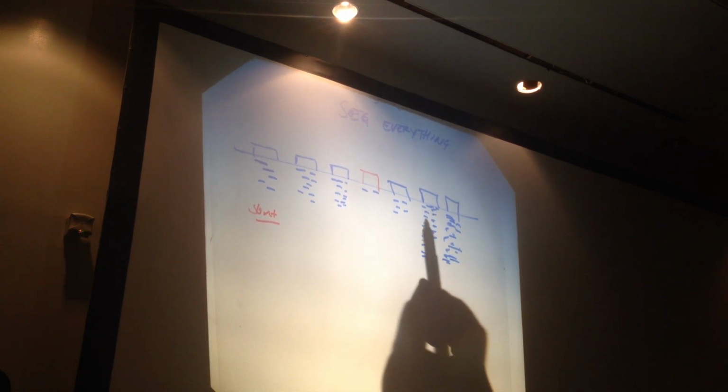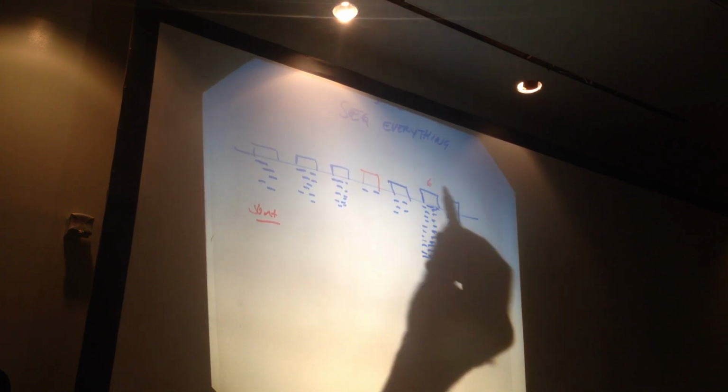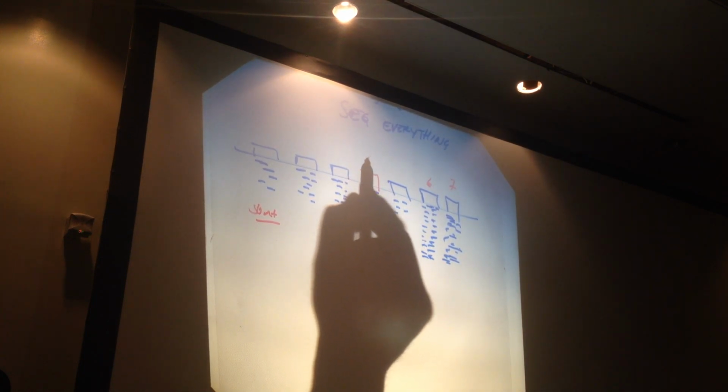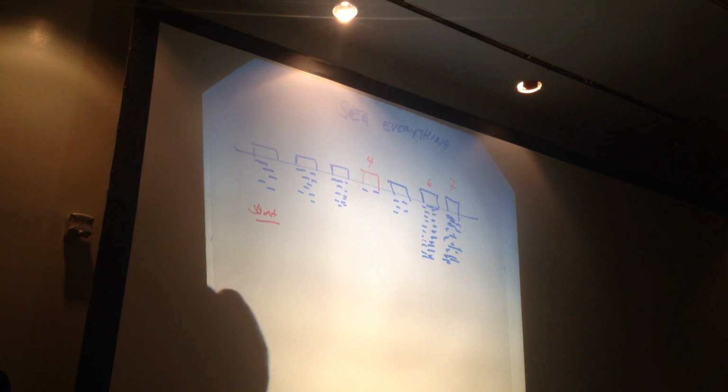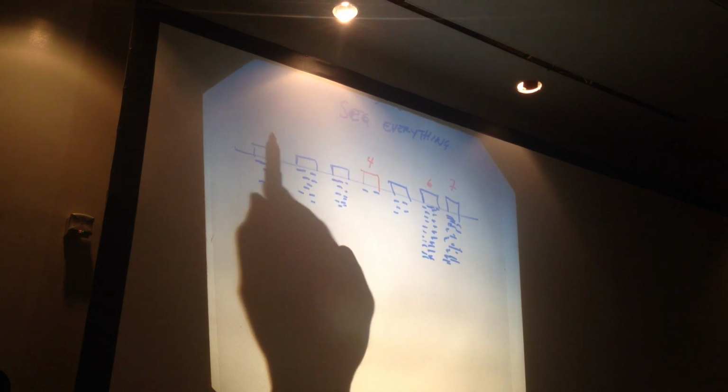And so you can see here I have a lot of little sequencing runs under exon 6, and I have a lot of them under 7. I have 2 under exon 4. That's it. But notice they fit nicely under there. I have less for 1, 2, and 3.